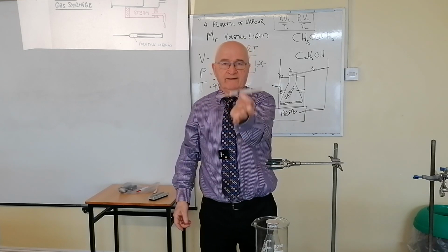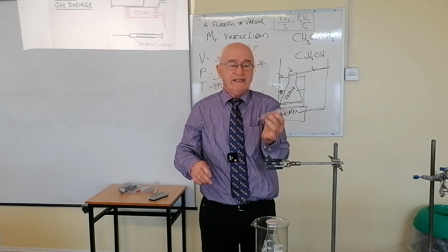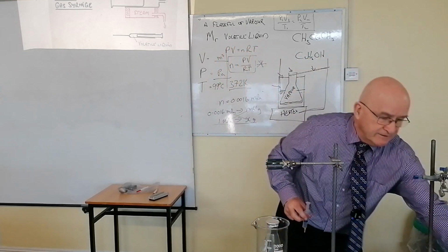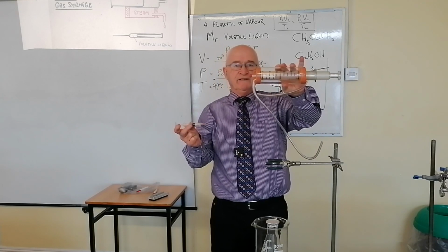And you'd weigh this. You'd weigh that. And what would you do next? You would now inject a small amount of this into the gas syringe, which is in steam, which is in the steam jacket.